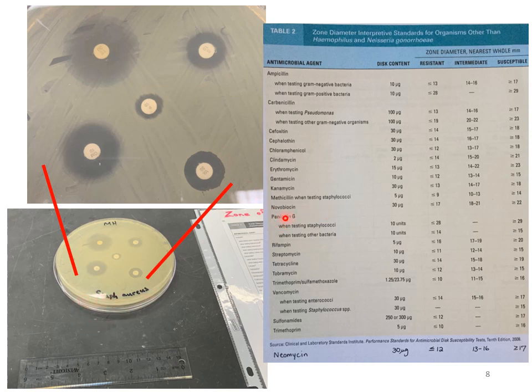So you would go penicillin when testing Staphylococcus, and once you have your measurement, which here would have been a very small measurement, let's say 10 millimeters, even less than that, you would look over and say, oh, our diameter is less than 28 millimeters. So Staph aureus is resistant to penicillin.